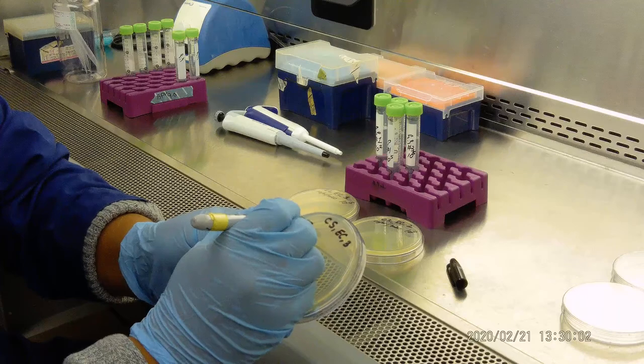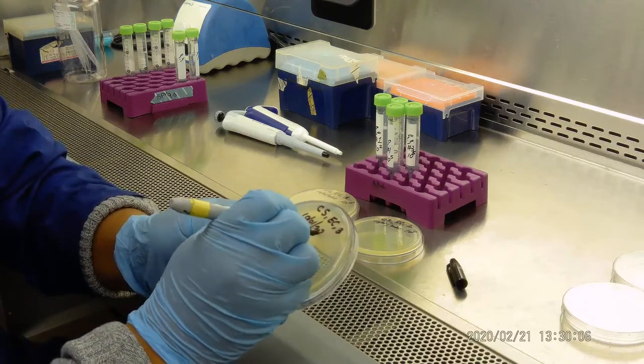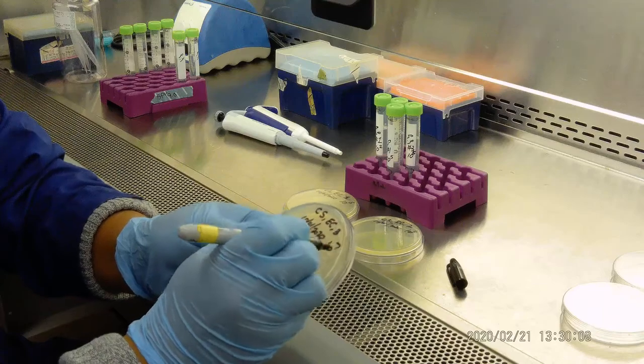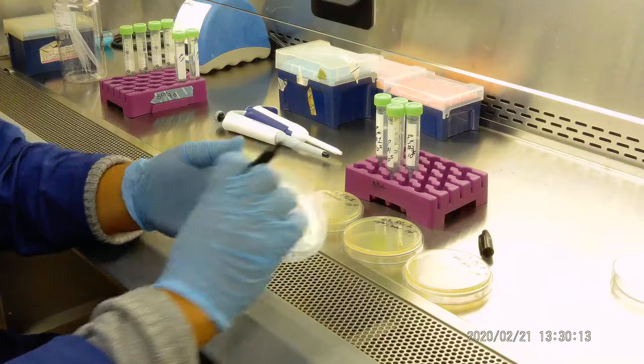So for number 3, we do 10 to the 7. That can be real quick. Okay, now we're also going to label here.